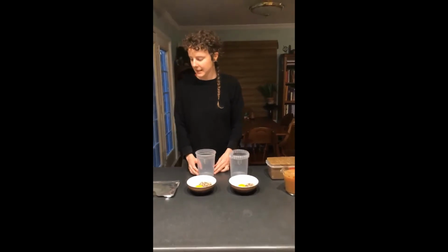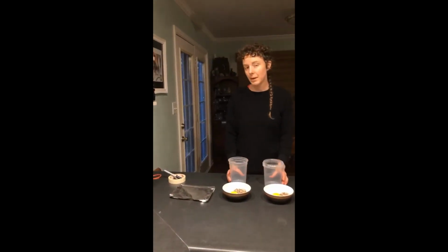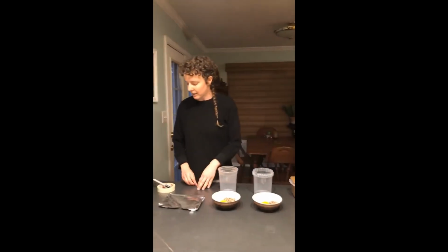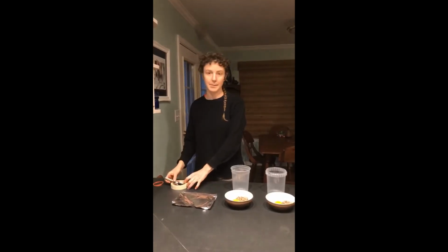And then the last things that you'll need are tinfoil, because we're going to set up an experiment where we cover one of our Winogradsky columns totally with tinfoil. You don't have to do an experiment where you have two different columns, like a control and an experimental. You can just make one column if you want to just observe. And also we have some tape and marking pens so we can label our experiments.